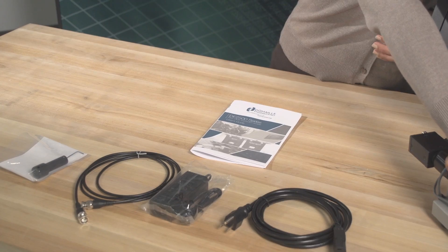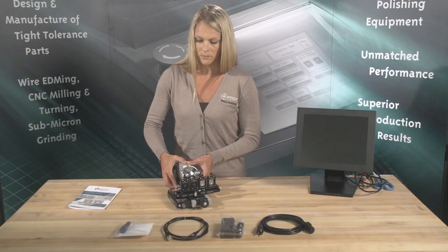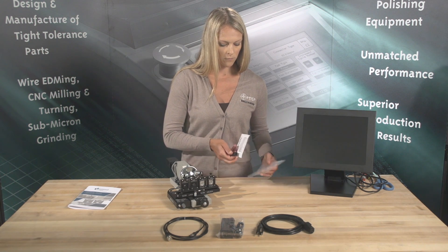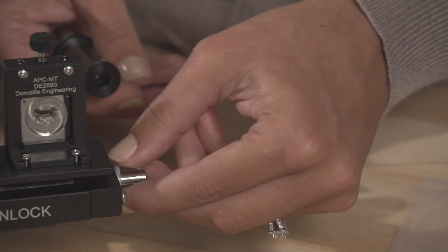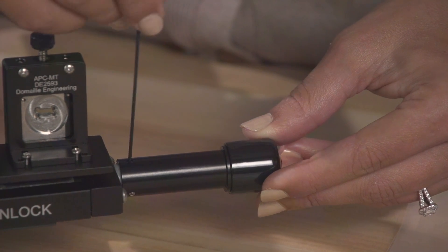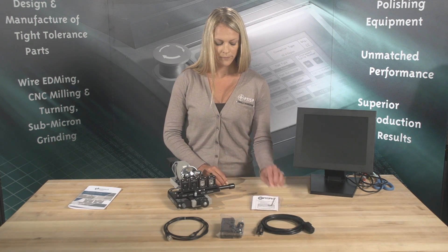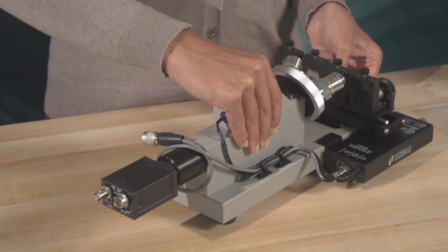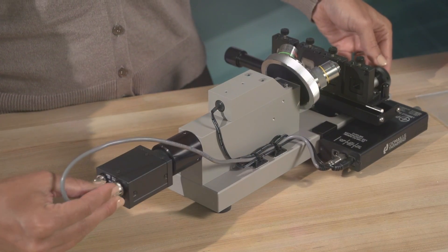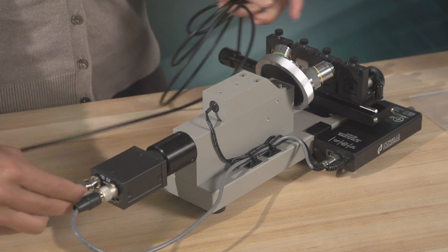Monitor and adapters are available for purchase separately. To prevent damage during shipping, the adjustment knob for the linear slide has been removed. To install the knob, follow these steps: slide washer on, slide knob over shaft, and tighten the two set screws with the hex wrench provided. Once the adjustment knob has been installed, plug the CCD power cord into the back of the camera. Next, plug in the BNC to the back of the camera, then into the monitor you are using to view the microscope image.